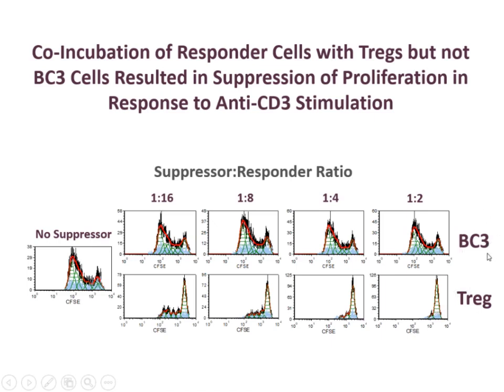As a control, we included a different cell line that's not a T regulatory, and you can see that these histograms all look pretty much like the control. So nice to be able to trace that activity in vitro and be able to focus in on the cells that are being suppressed and screen out the ones that are providing the suppression.